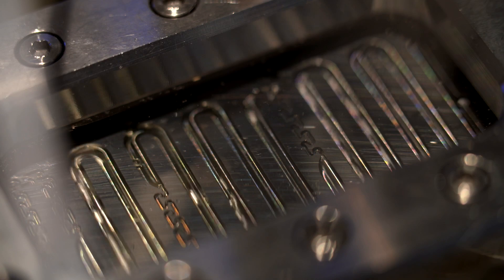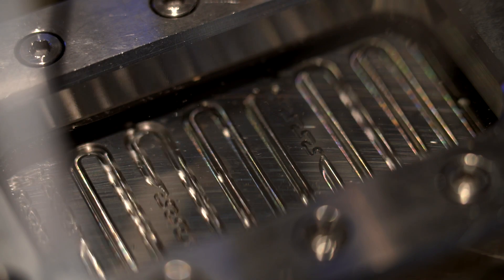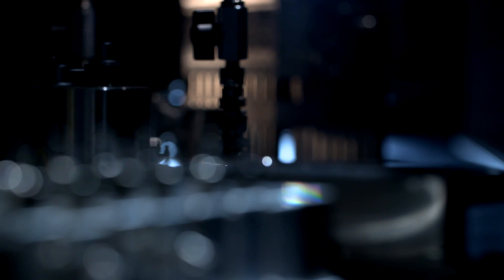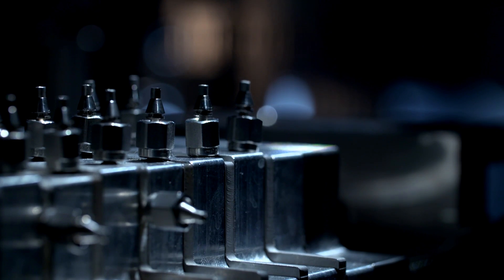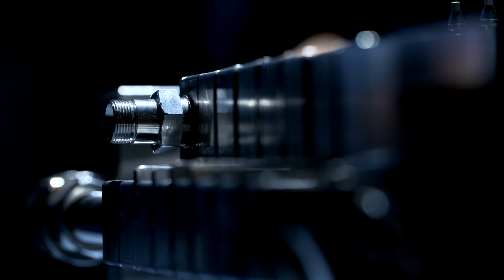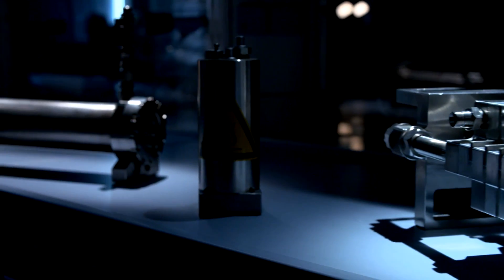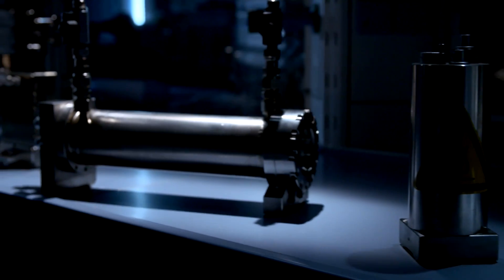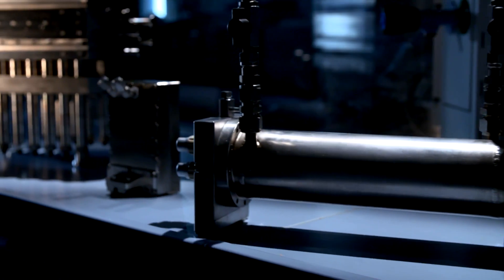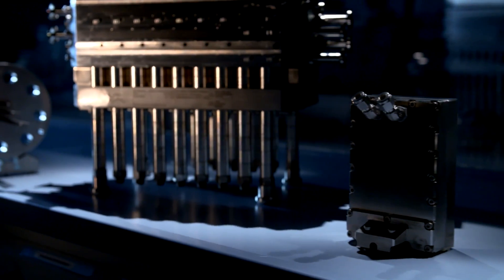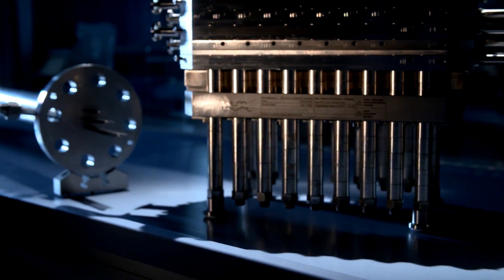Since reactions in the flow plate and Miprova reactors take place in small channels with a diameter of just a few millimeters or micromillimeters, the process is highly defined. And that makes upscaling relatively simple. The channel cross-sections in the reactors are simply enlarged, or several channels are arranged parallel to each other. These so-called micro and millireaction technologies make possible the production of several thousand tons of a given end product each year, from pharmaceuticals and fine chemicals, to petrochemicals and food chemistry.